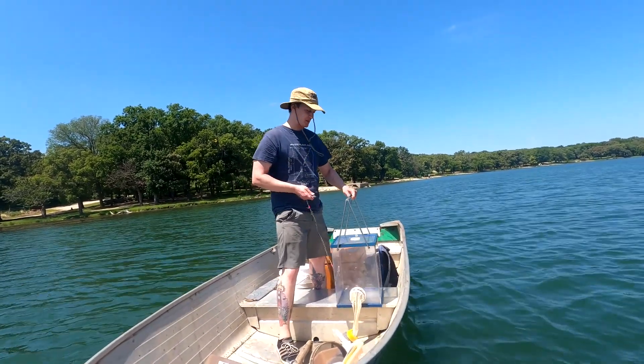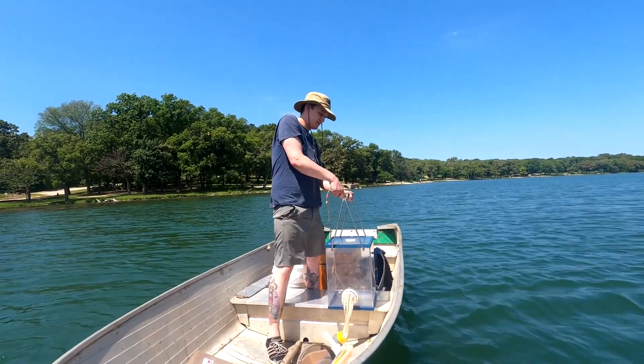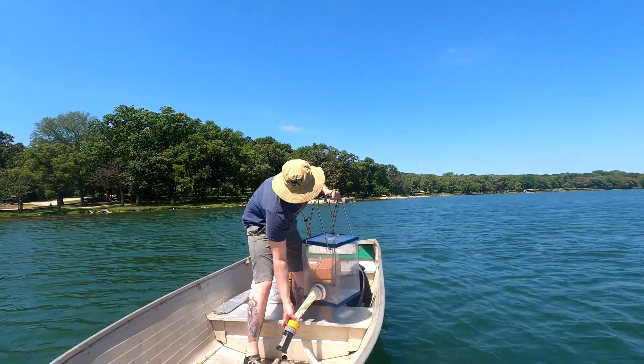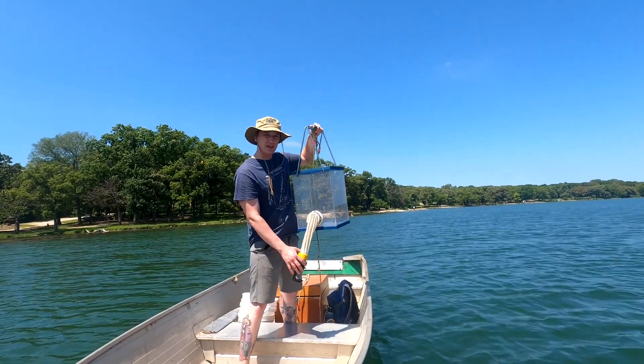We'll lift these two metal arms above it and attach the carabiner on top. You can see we've got another net on here, and eventually all the sample is going to be filtered down through this net into the cup.